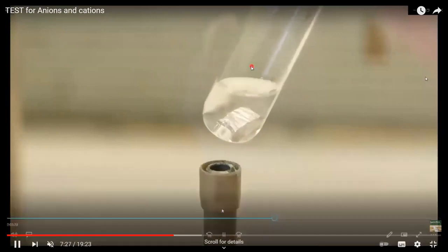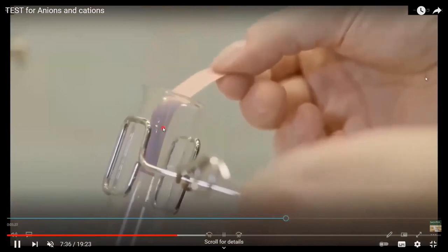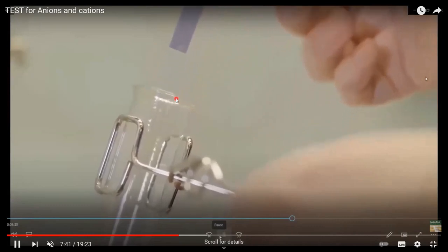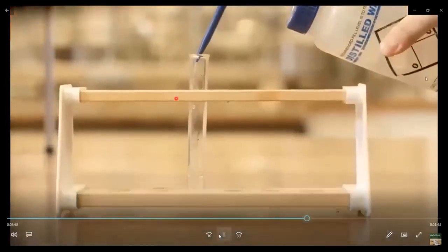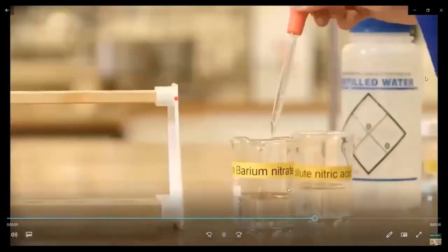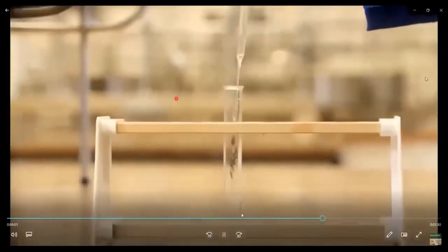And as the damp red litmus turned blue, this confirmed the presence of ammonia gas. So this was a test for the negative ion, nitrate ion. Then if you want to identify or test a sulfate ion, for the test for sulfate ion, we make a salt solution first, and then we add nitric acid followed by drops of barium nitrate or a small amount. We'll observe a white precipitate.